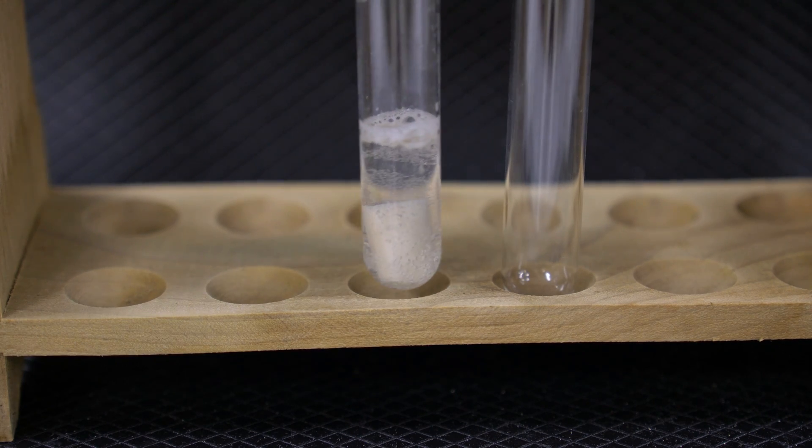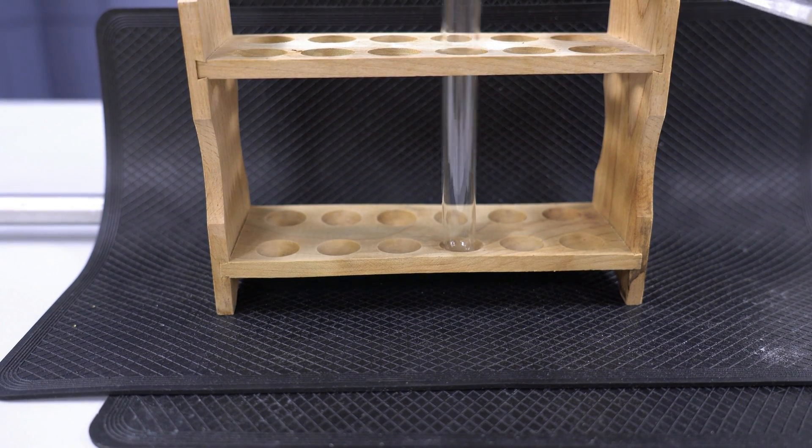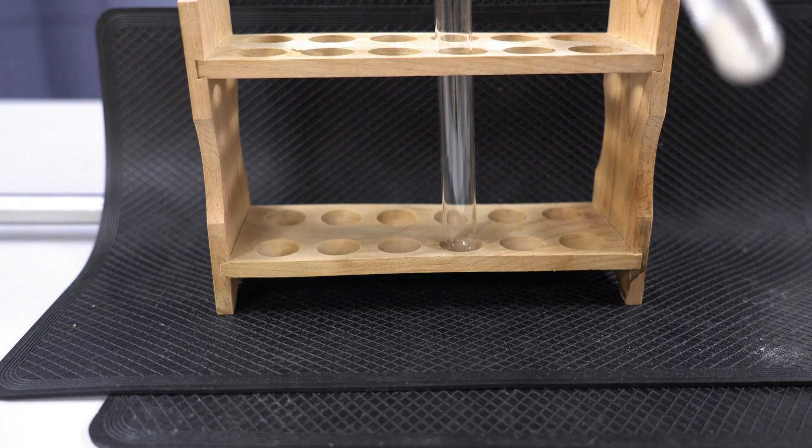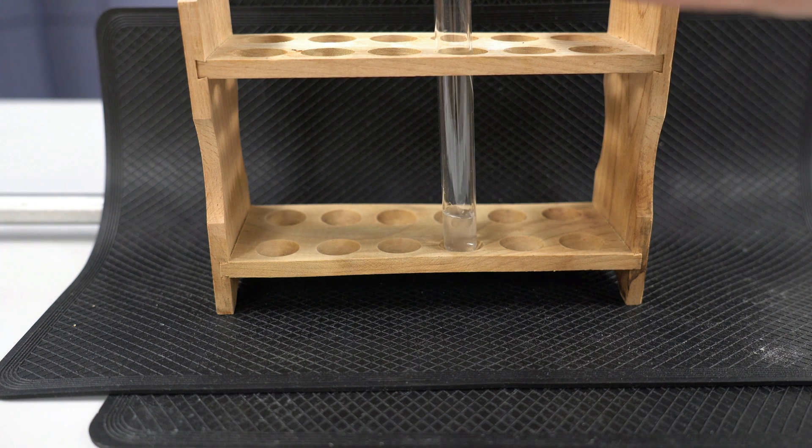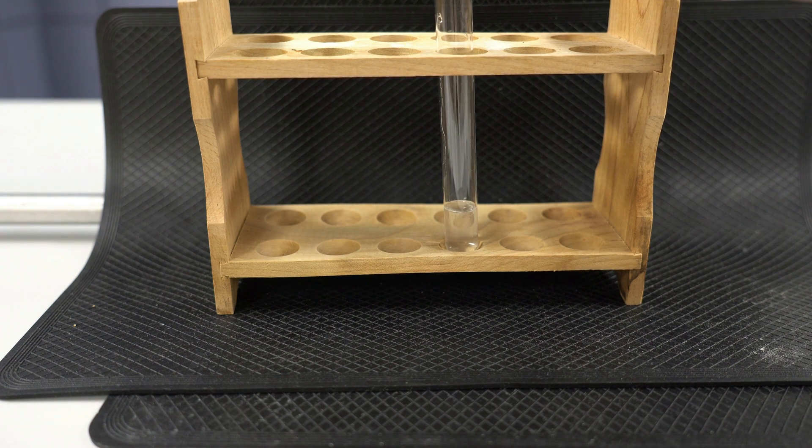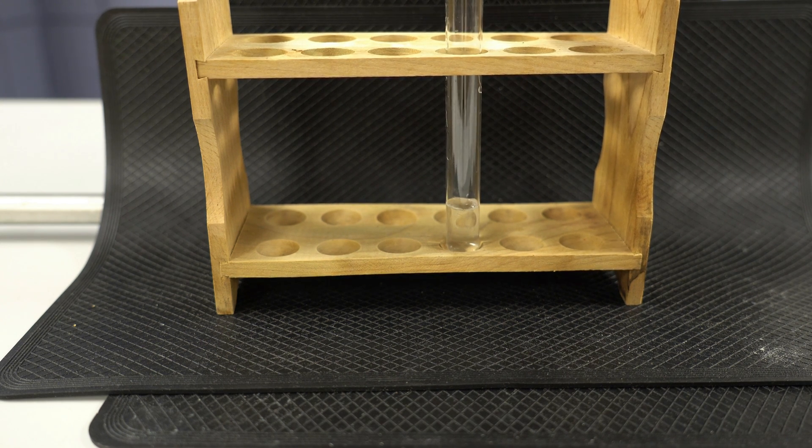What I'm going to do is take the liquid from here and simply pour it into our second test tube, trying to make sure we don't also include the potato. Pouring off that liquid, decanting that liquid there.